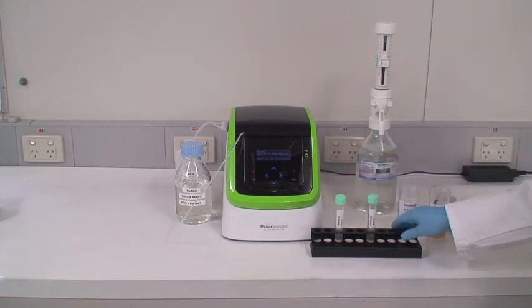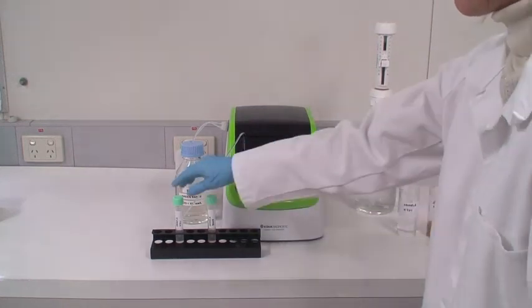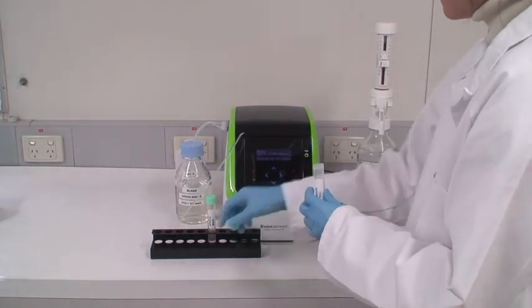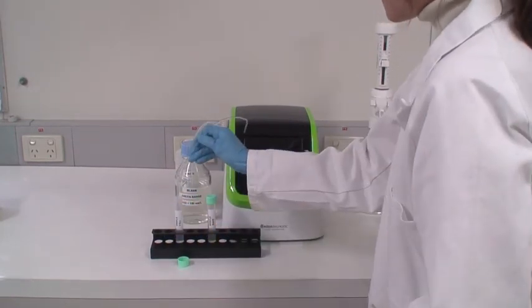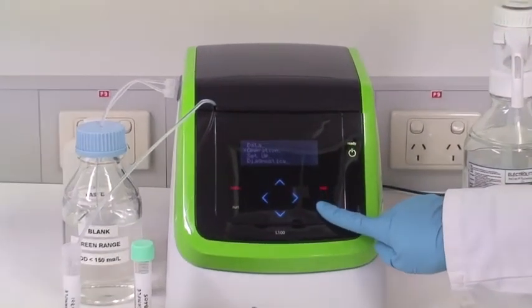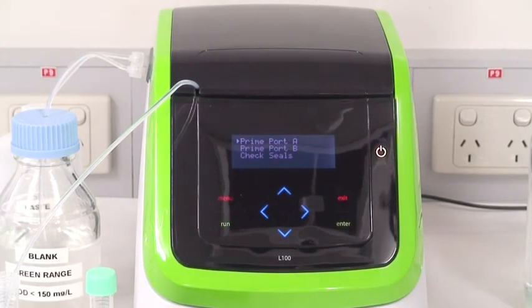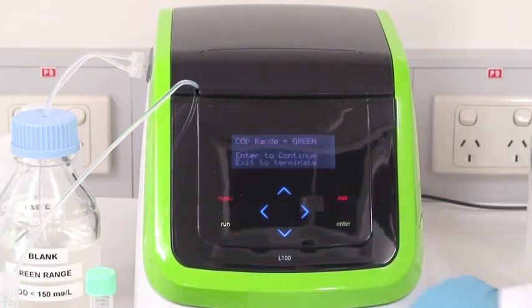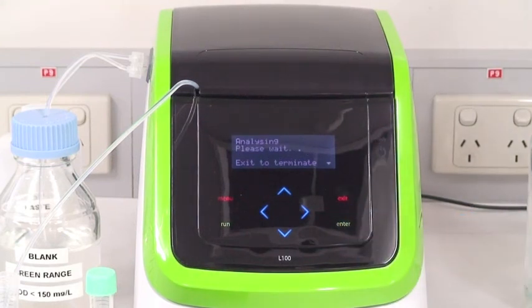Bring the samples to the L100. Present the sample to port A and prime port A twice to fill it with the sample. Now press the Run button. The L100 will now analyze the sample and the result will be displayed at the end of the analysis.